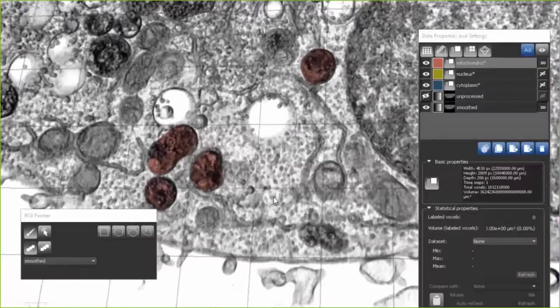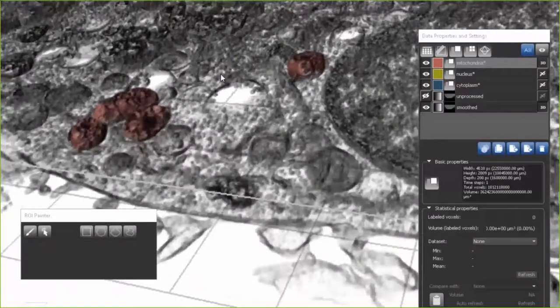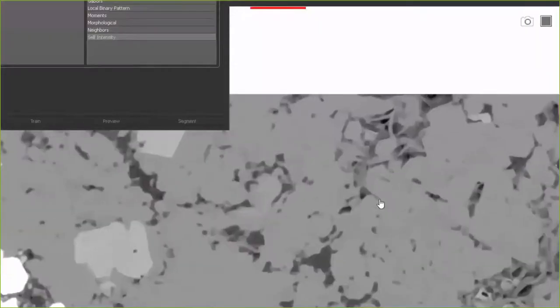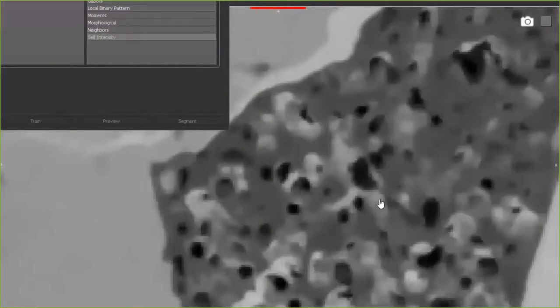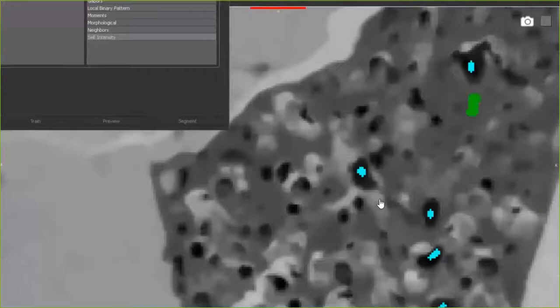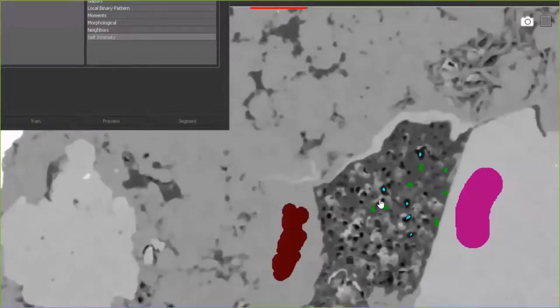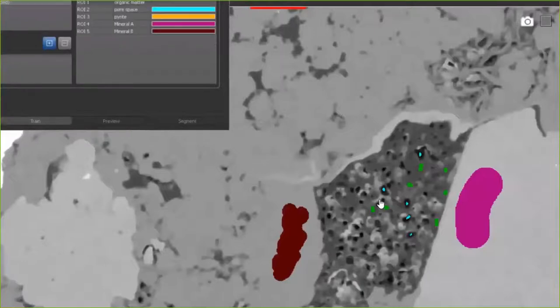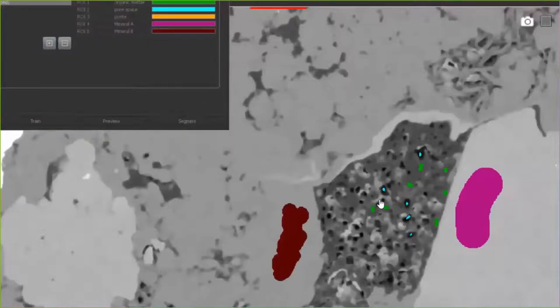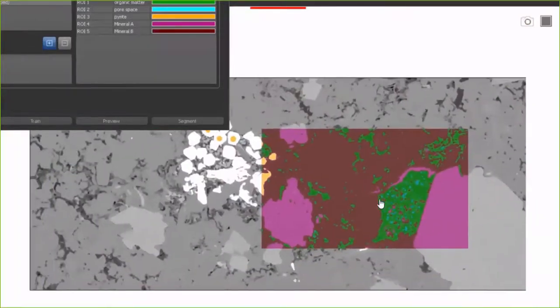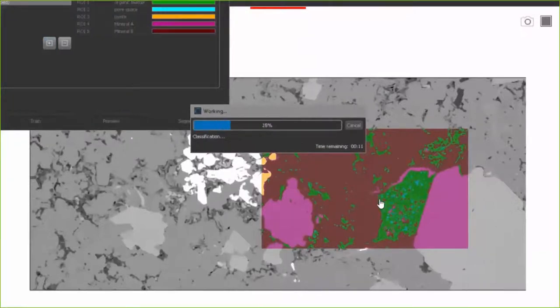These segmentation tools have been available in Dragonfly since early 2017. For automatic segmentation via machine learning, we introduced a solution based on simple linear algebra tools such as Random Forest — quite similar to the WECA segmentation in Fiji, and Zeiss's Intellisys. With this machine learning, a user paints a few representative pixels — pores, organic material, quartz, calcite — and the software learns from those examples and extrapolates to the rest of the image. This is called the Segmentation Trainer.